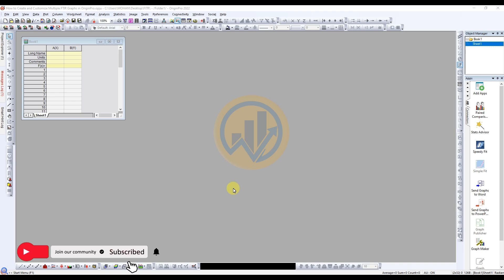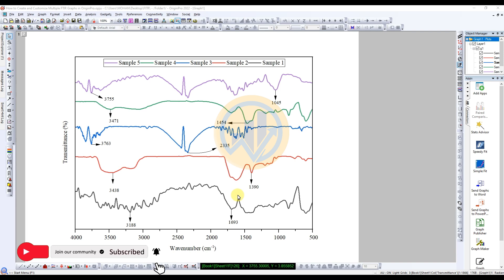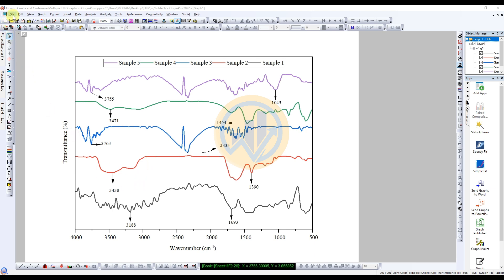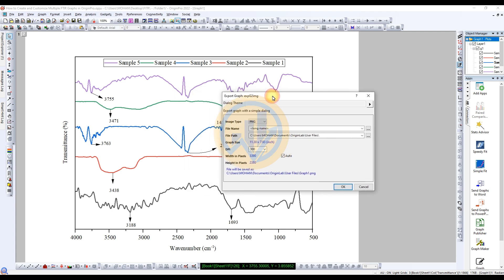Now we will discuss how to export a quality publication graph in OriginPro software. This is for a multiple FTR graph in OriginPro — the graph is already drawn. To export, go to the File menu, click Export Graph, and the options dialog will open in a new tab.